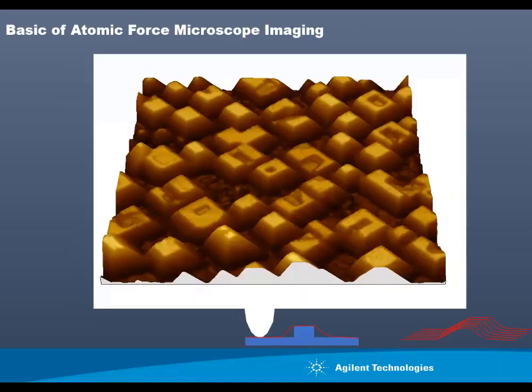So the essentials of the Atomic Force Microscope: when I give people a lesson about AFM, I always show this image, and I ask them, look at this image. This is a crystal. Can you tell what color this sample is? And if the audience says, I don't know, that's the correct answer, because an AFM image is not a colored picture, and the color you see is artificial. I can get any color you want. It does not mean color.